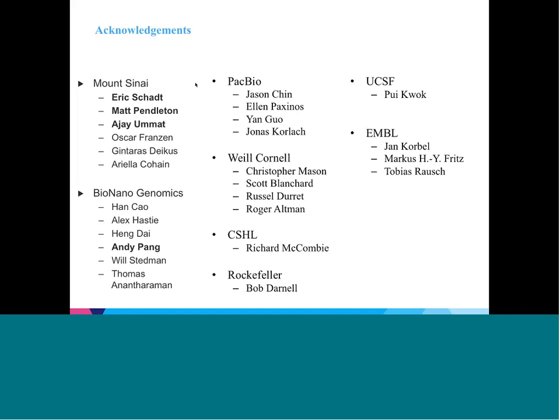New York Genome Center is running their first biopsy samples, and we're looking into heterogeneous tissues, and so that is definitely on our roadmap and of keen interest to us here at BioNano to start exploring the cancer work. It's likely, to your point, that higher coverage depth will be required, but we have yet to really determine what the coverage requirements are.